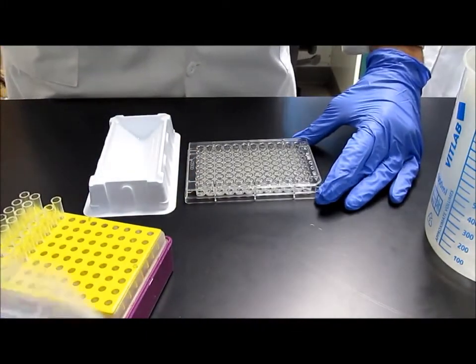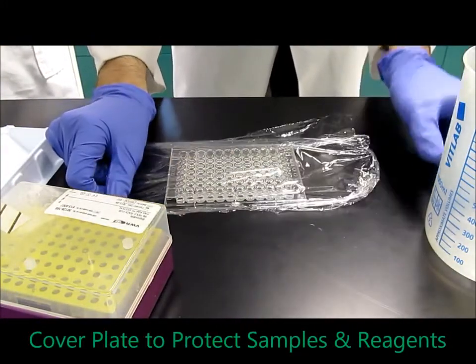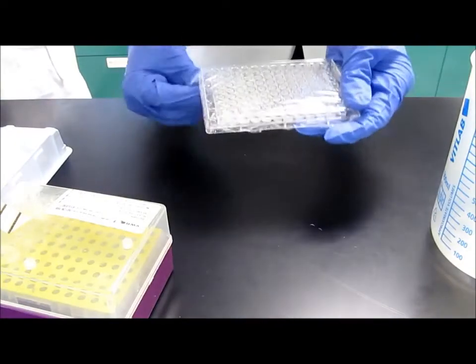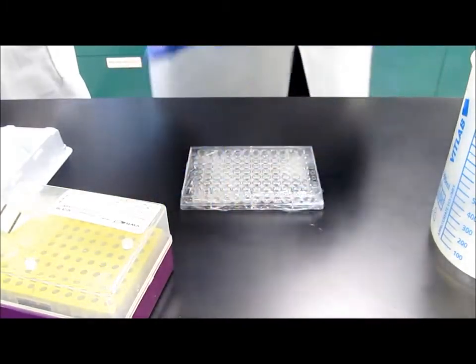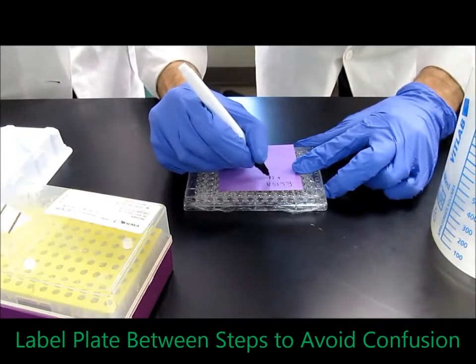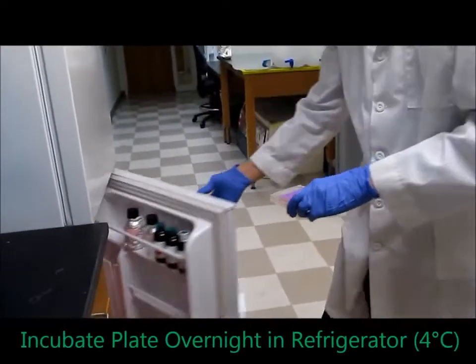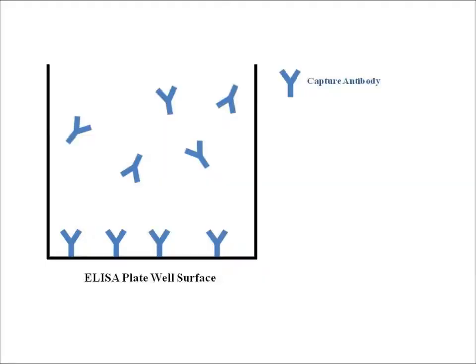After that, just give the plate a gentle tap to remove any air pockets. Then wrap the plate in some plastic wrap in order to prevent any reagents from evaporating overnight when you leave the plate in the refrigerator. And after it's been wrapped thoroughly, grab a post-it note or a piece of tape so that you can label the plate, to prevent yourself from forgetting what step you're on, or to prevent other people from picking up your plate and using it for something else. So again, you're going to leave your plate overnight in the refrigerator at 4 degrees Celsius. What will happen is the capture antibodies will adhere to the plate and some will remain in the solution.